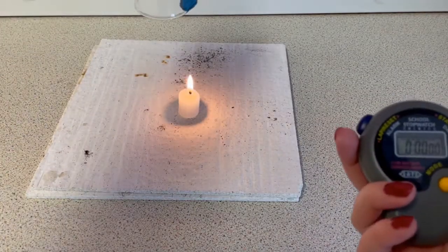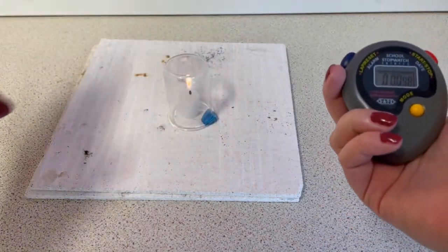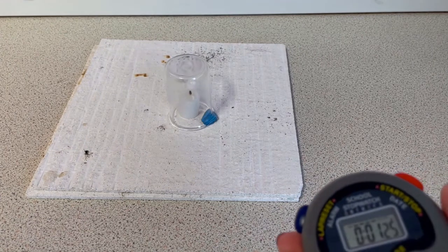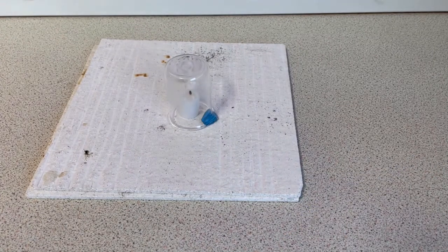So let's place that over the candle and time how long it takes for the flame to extinguish, and it was 1.25 seconds. So as I've already said, all of these measurements will be repeated so that we can calculate a mean and check for any anomalous results. But we can see a general pattern from our first set of results that as you decrease the size of the beaker, the candle extinguishes quicker.